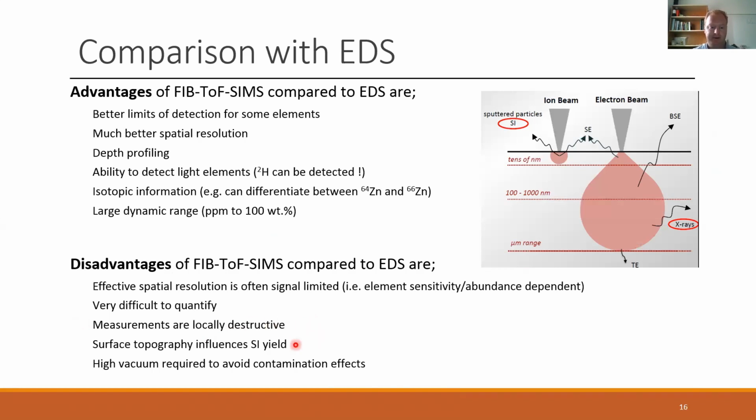Surface topography, as I mentioned before, is also an issue with EDS in some cases, but it's potentially more of an issue in ToF-SIMS and a high vacuum.